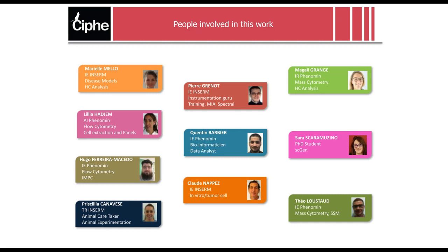And finally, there is plenty of support material: videos, webinars. There is also a blog that demonstrates the different capabilities of the Cytobank platform. So I really encourage people to go and look at this to train themselves on the new interface.